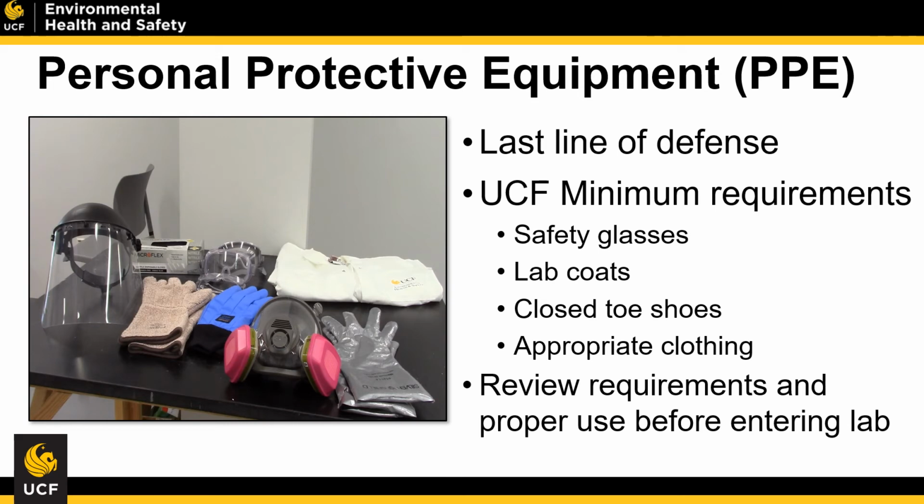The purpose of this is to make sure that if a chemical is spilled, you are not exposed to any unnecessary risk. Some types of protection that we'll talk about are eye protection, glove protection, and lab coats. For your eye protection, we are going to ask that you wear lab safety glasses that meet an ANSI standard of Z87.1. There are different standards, and that standard could be a Z87.1 plus, but the plus is an indication of high impact. For most practices within a laboratory, we're really more concerned about your splash hazard.